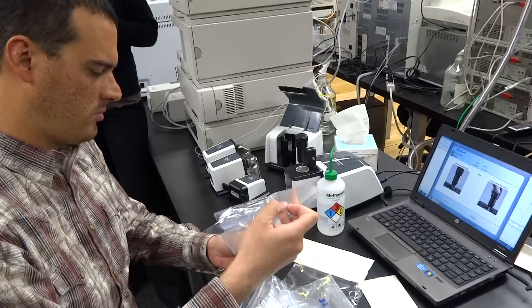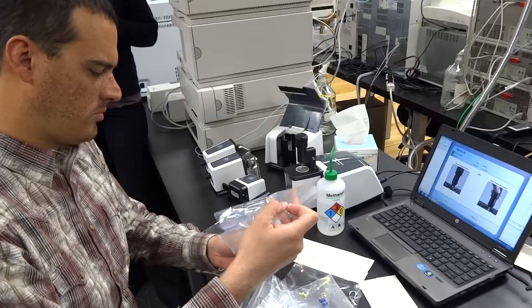Very easy. You can build. We run samples and we can build around sample objects. It's in the simple software.